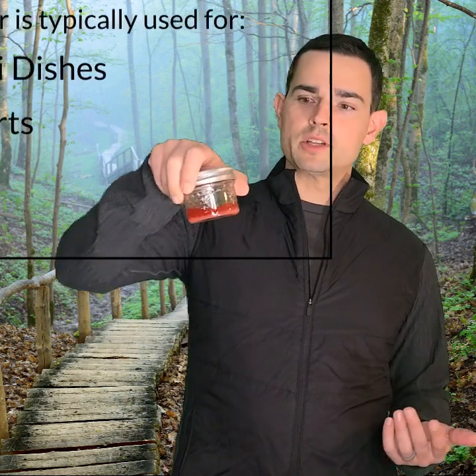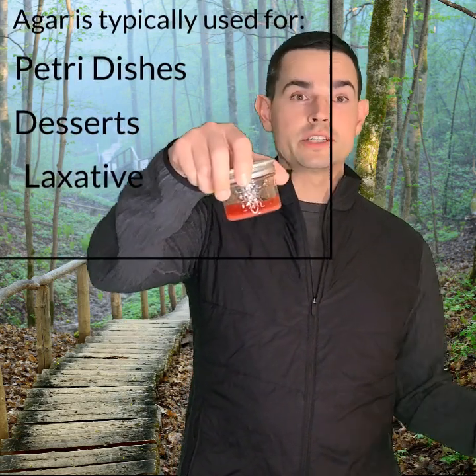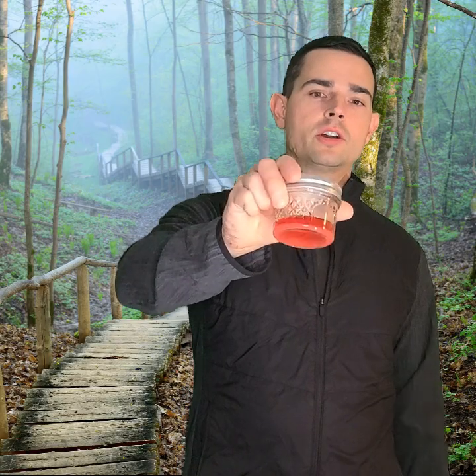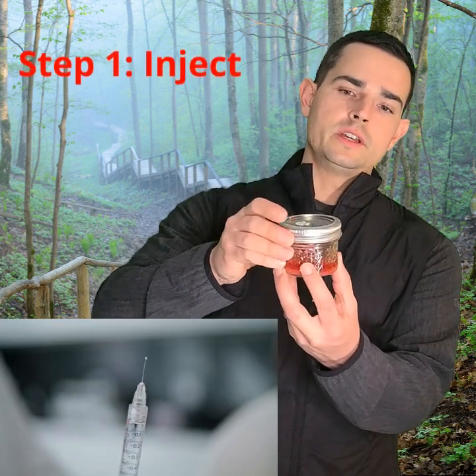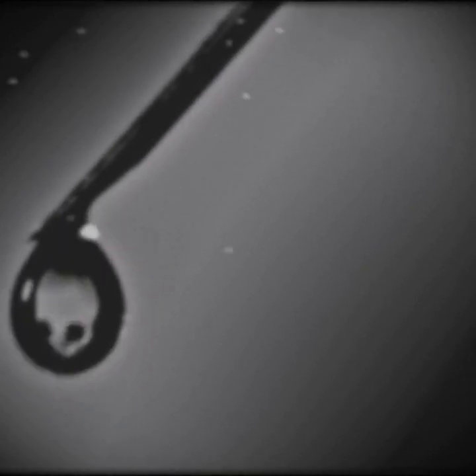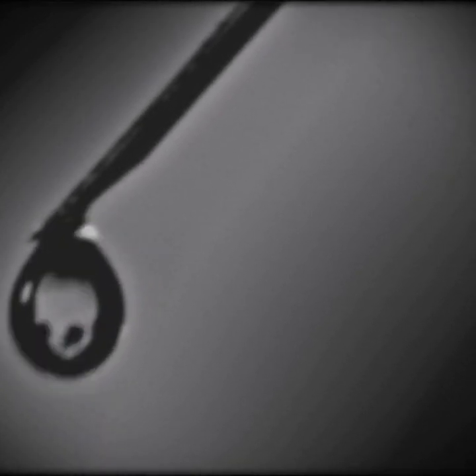So basically, agar — here's an example of it. You're probably used to seeing it in a petri dish. This right here is just a jar to make it easier for injecting your spores. You would inject it in there, and you want to inject as little as possible because less is more for spores. You're basically trying to separate the dirtiness of a spore and make a monoculture out of it.